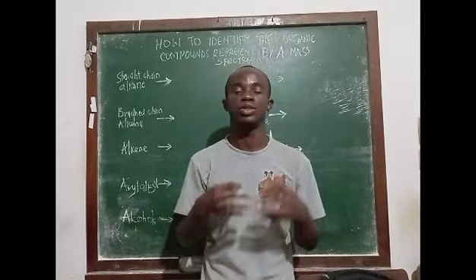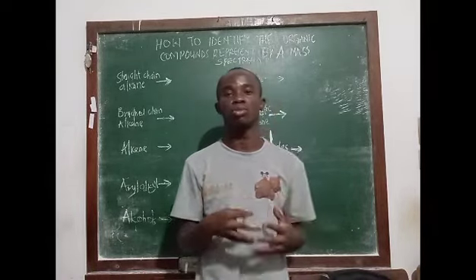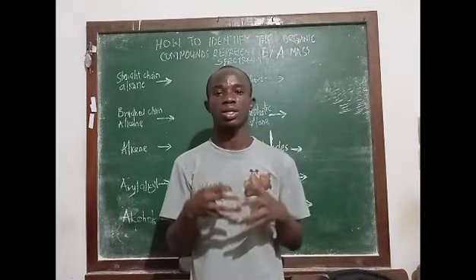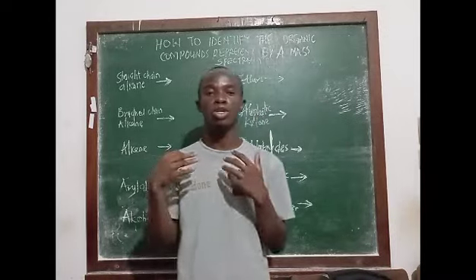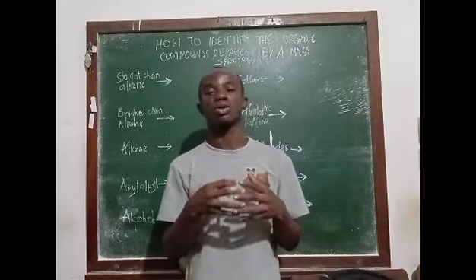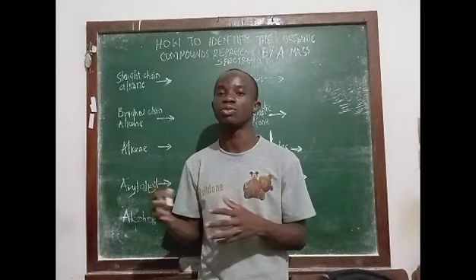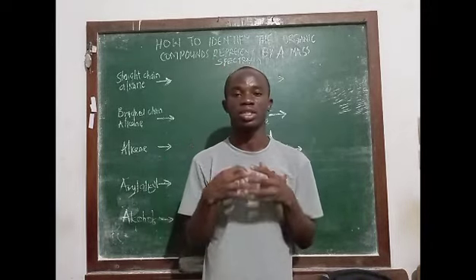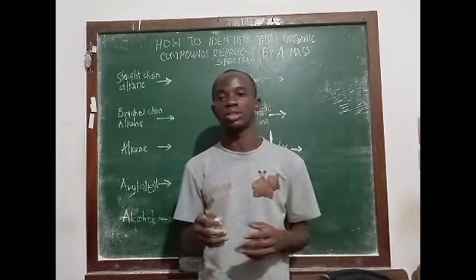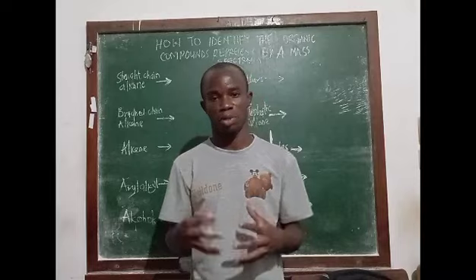In this video, I will be discussing how to read a mass spectrum in order to identify what class of organic compound the mass spectrum given to you represents. There are some key things that you can always look out for in a mass spectrum that will easily help you know what class of organic compound it represents. These are some of the things I'm going to be sharing in this video. But take note that the things I'm going to be mentioning are not the only things you expect to see in a mass spectrum.